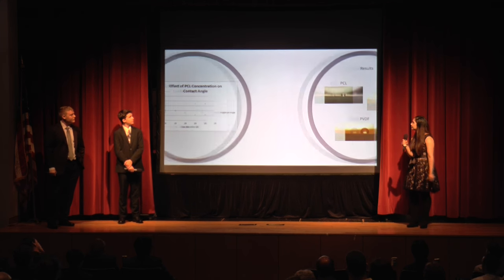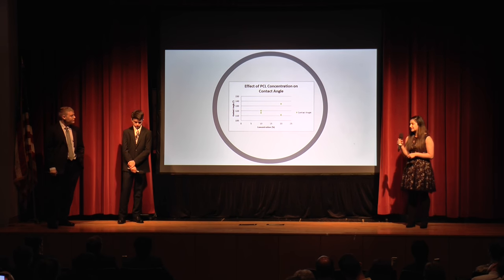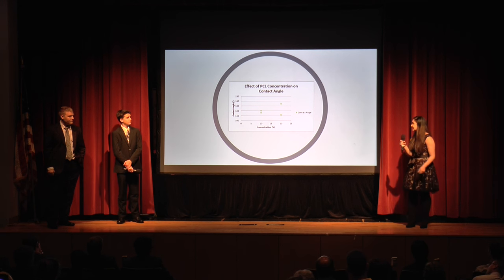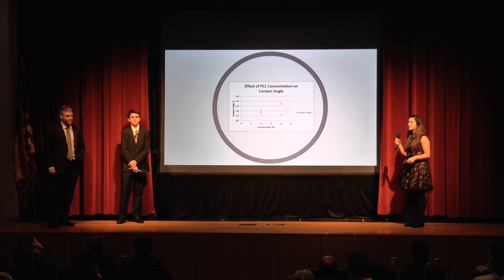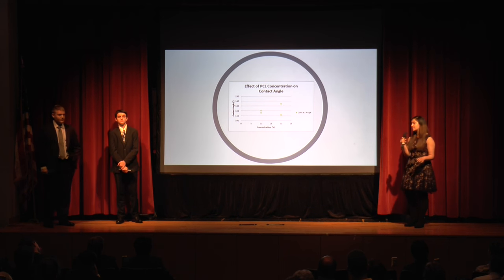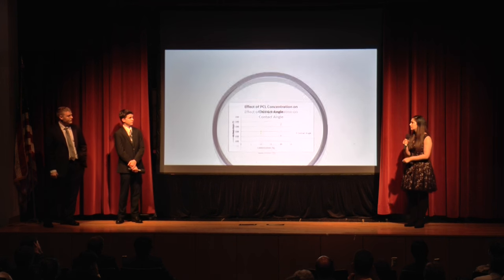So this is a more in-depth analysis of PCL, and as you can see, there is no clear definitive trend between the concentration and the contact angle, so we would have to conduct more tests next year to see if we can fill that little gap and create equality.